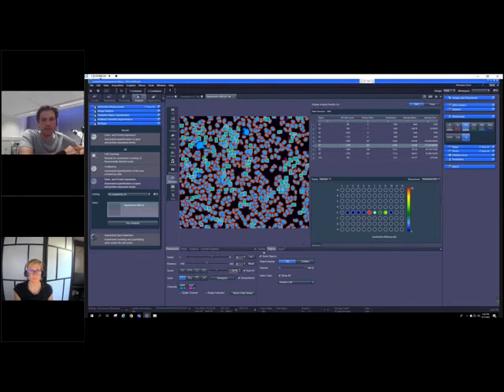And there is a 4th bio app available, which is called spot detection. The spot detection bio app is another bio app where you have 2 different layers of segmentation. Again, the first one is segmenting a primary object like nuclei, either based on a neural network or on algorithm-based thresholding. And secondly, identifying spots within this object. This is, for example, an assay where you would like to do foci counting within the nuclei, like single strand breaks, DNA strand breaks, etc. And this is what we have set up the spot detection bio app for.